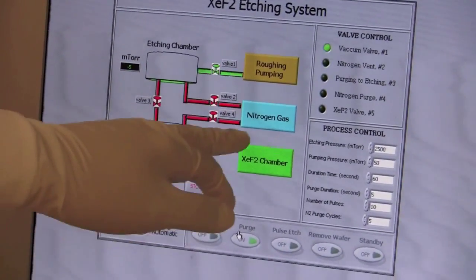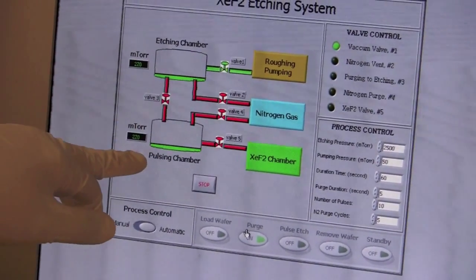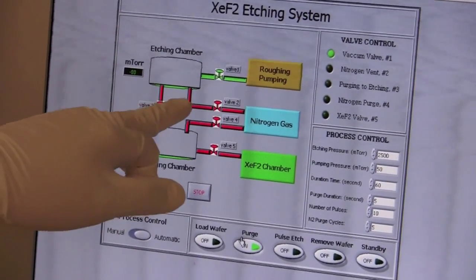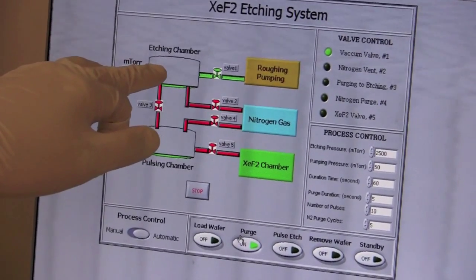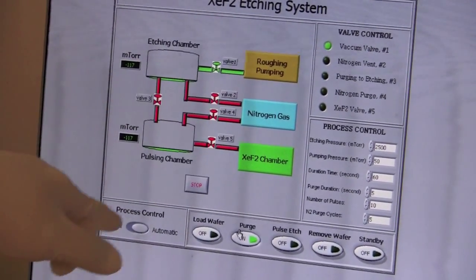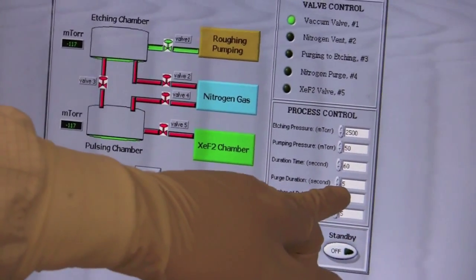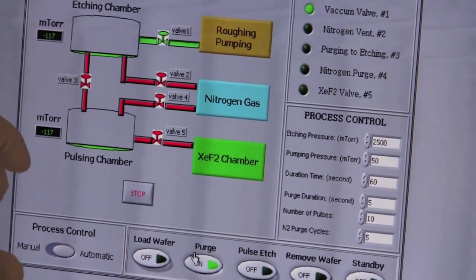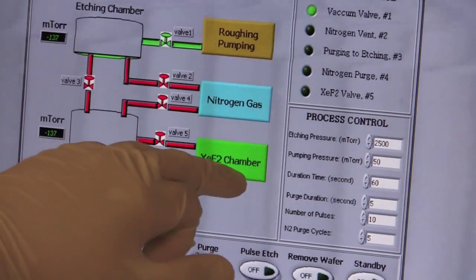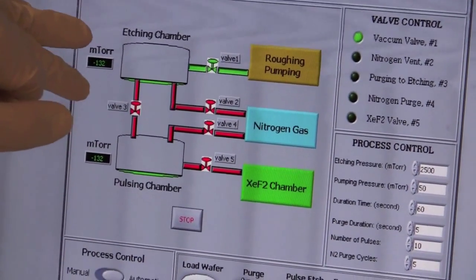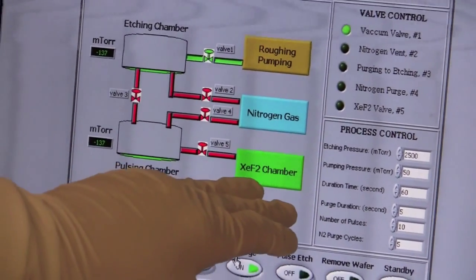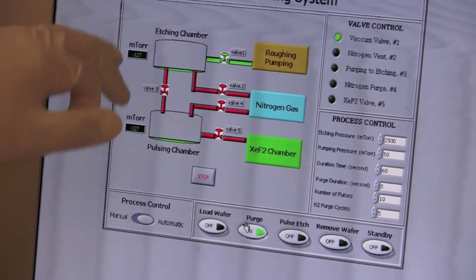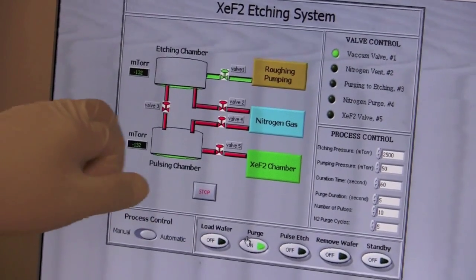When you're purging, we are pushing nitrogen gas through the etching chamber, but it'll show you the pulsing chamber also filling up. It's not really filling the pulsing chamber, it just looks like it is because of the way the transducer is set up. After it fills the etching chamber, we rough it out with the roughing pump. And this does this however many times you set it for, in this case five cycles, and it purges for five seconds. We recommend you keep the purge cycle like this. Now when we use the xenon difluoride gas, it's going to come out of this gas chamber directly out here into the etching chamber. This is important to know because when you're feeding xenon difluoride to this etching chamber, you're not using the pulsing chamber, so you're just doing a direct feed through. And this is going to be important later when I explain how this will affect your etch rates.